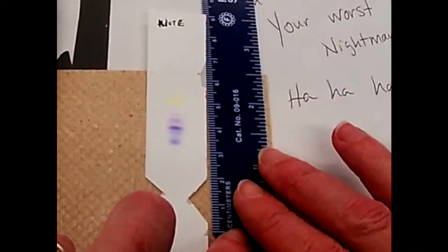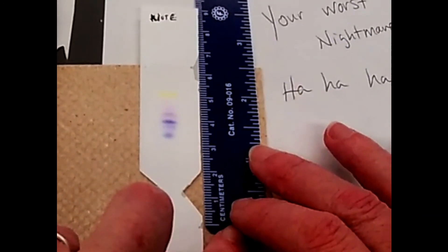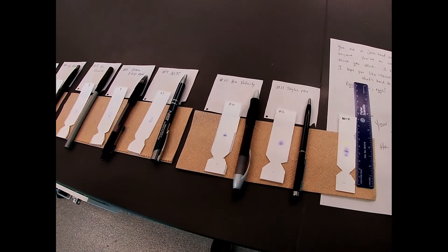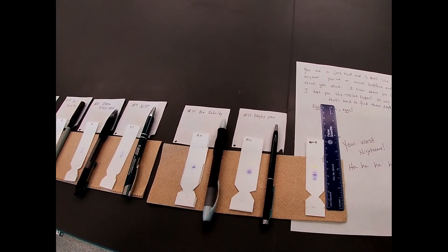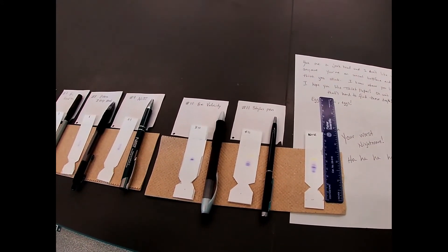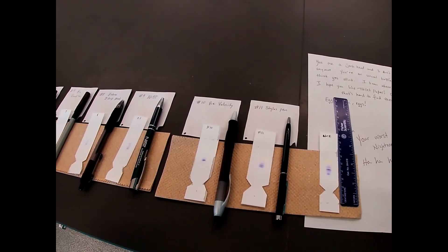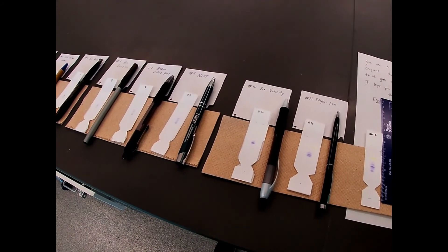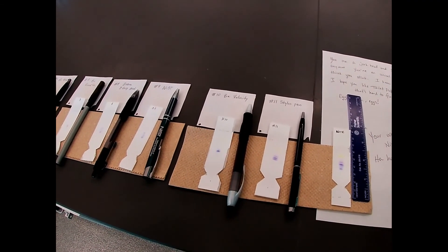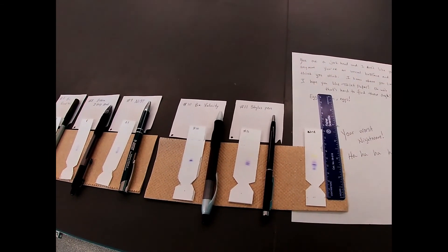and then we can use those to compare to all of the other inks that we see. We can count the number of bands, look at the colors, what looks different, what looks the same, whether the same number of bands, whether it appears they have the same number of dyes in the inks, and then of course whether retention factors match up, and that's going to help us identify which ink wrote the note.